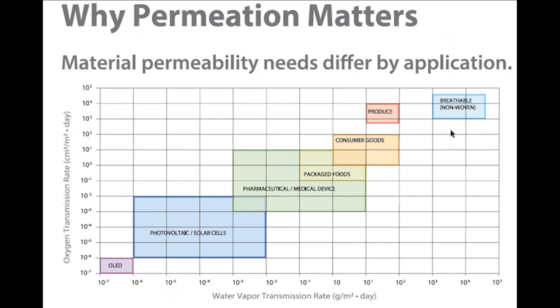So there's a low oxygen level in there to help reduce any rancidity of the oils on the chip and extend the shelf life. Also, the dry aspect of it also keeps the chips nice and crispy. You wouldn't want to bite into a chip that is soggy. So for a product like potato chips, you need good barrier for both water vapor and for oxygen. You kind of go down this chain, you look at pharmaceutical serums and drugs and things like that.